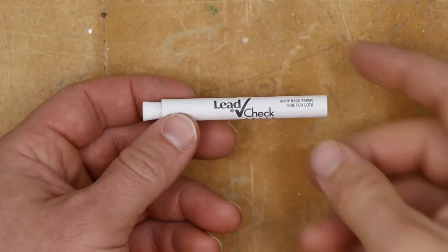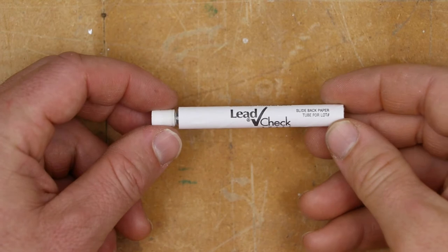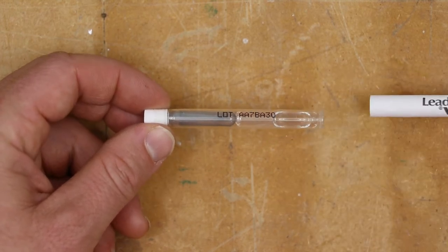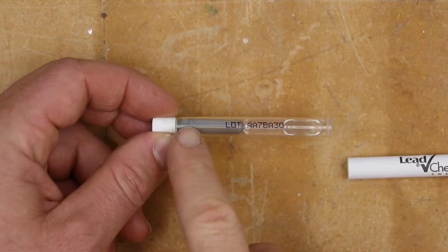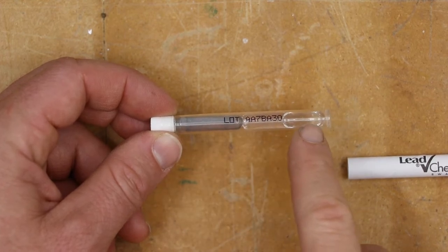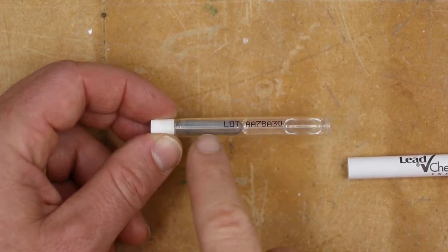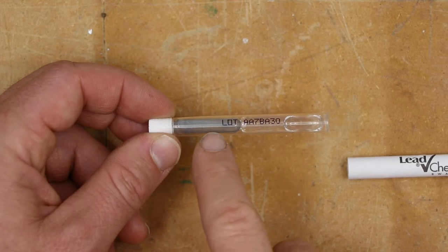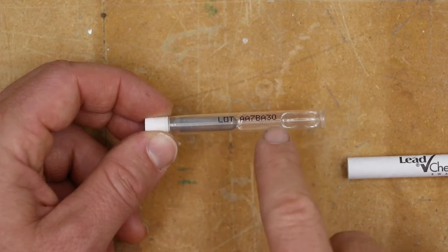I want to take a quick minute to investigate what's inside. As I pull this little sleeve back, we see a capsule on this side and a capsule on the other side. This one has a bit of a fine dust in it, and we got a clear liquid over here.